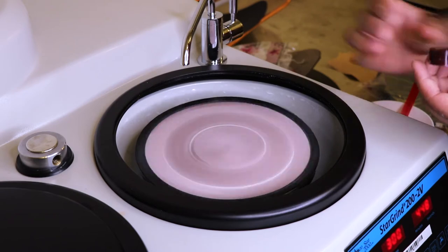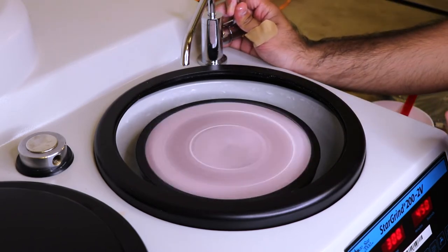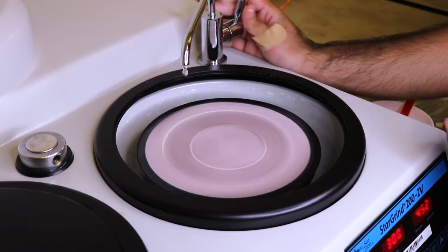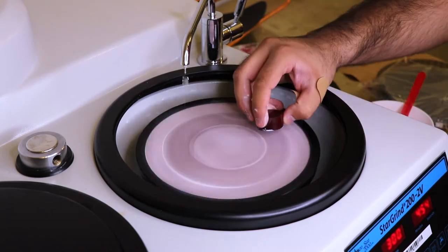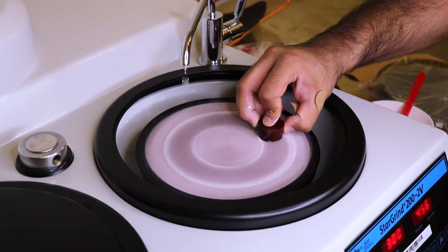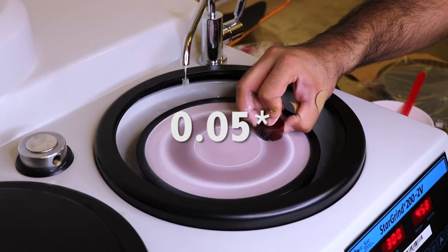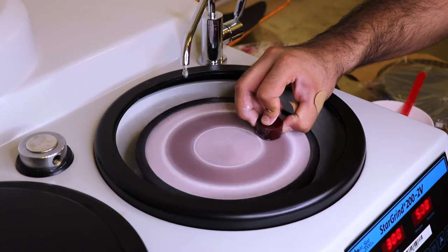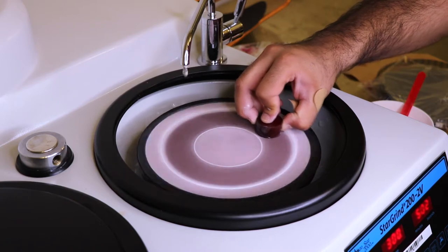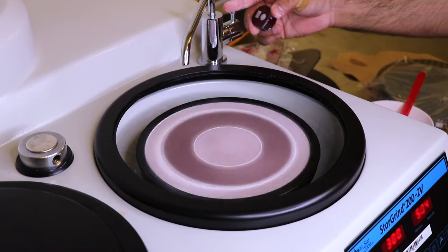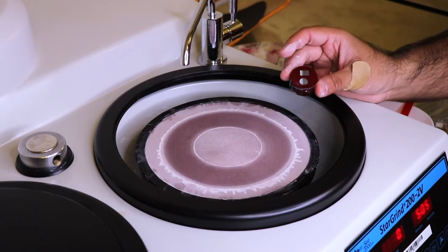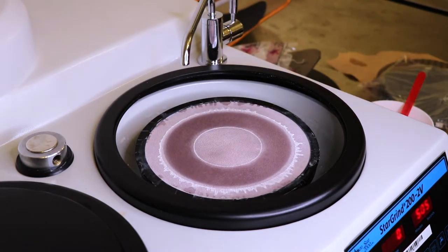Once you're happy with the results, there are two ways to move from the one micrometer powder to the 0.5 micrometer powder. You can clean the existing pad until there's no more alumina left and apply the 0.5 micrometer powder, or it's easier to have a dedicated pad for each different powder. So switch out the pad, prepare the next powder, and continue to polish your sample.